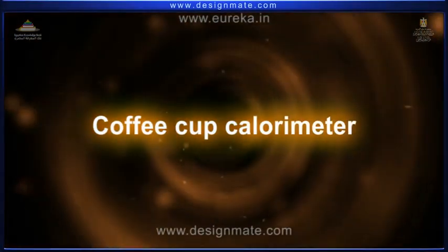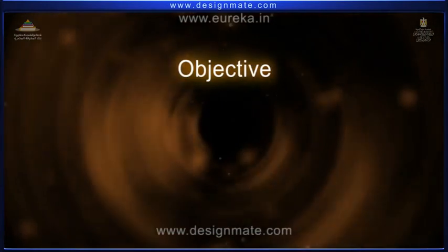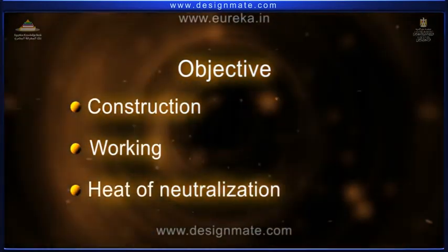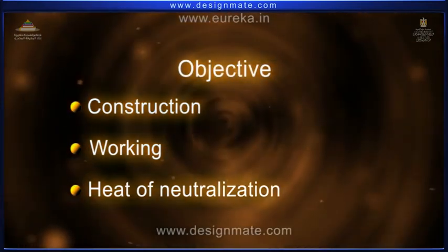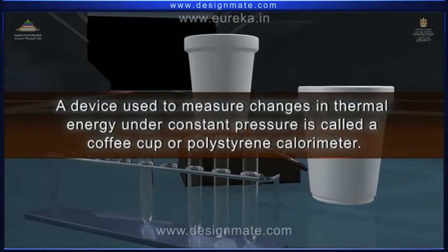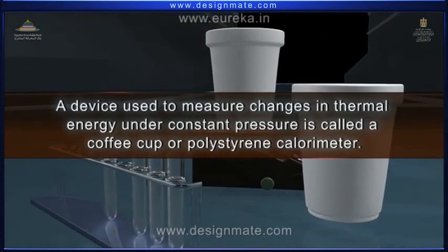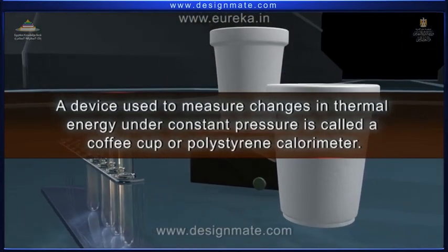Coffee cup calorimeter. Objective: to study construction and working of a coffee cup calorimeter and to calculate heat of neutralization. A device used to measure changes in thermal energy under constant pressure is called a coffee cup or polystyrene calorimeter.